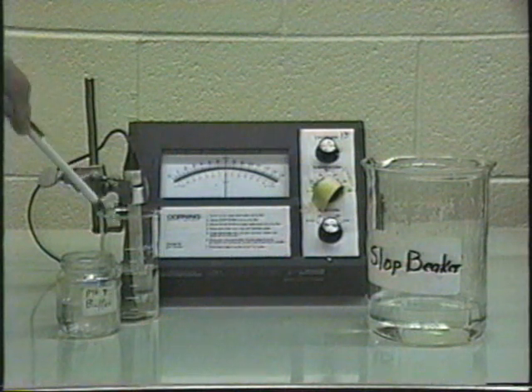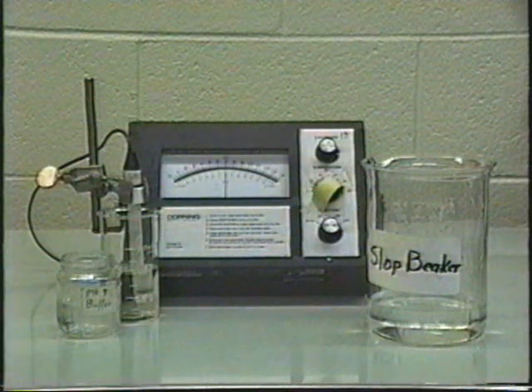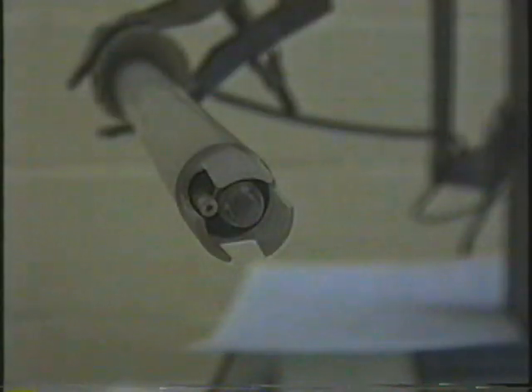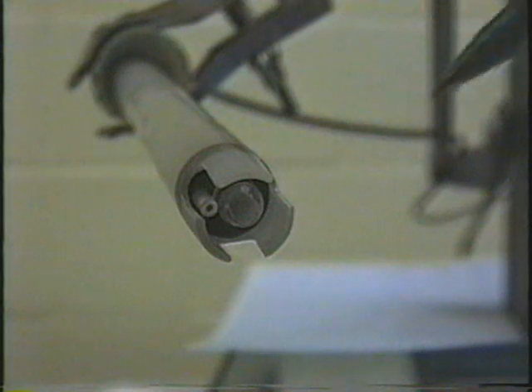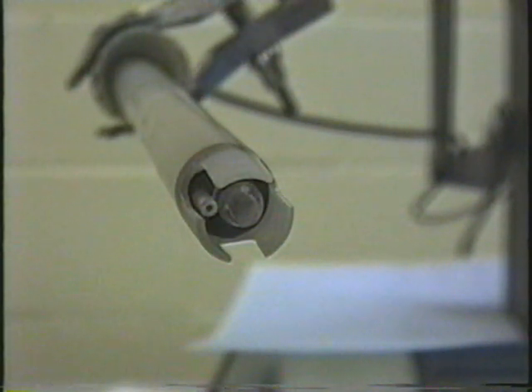Now let's take a closer look at the electrodes. Here's a close-up of the bottom of the electrodes. The larger bulb on this side is the glass electrode, which is sensitive to changes in pH, and the small tube on this side is the end of the reference electrode.